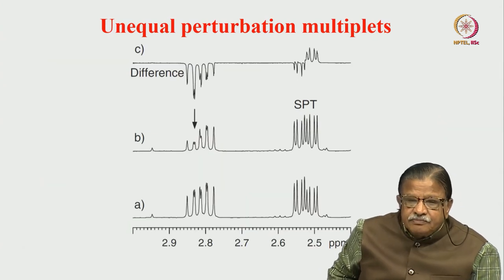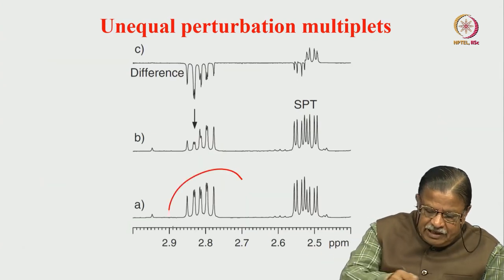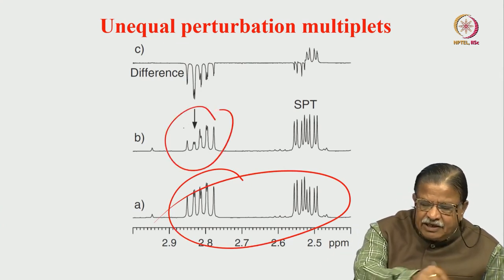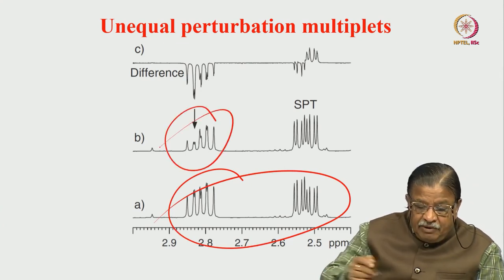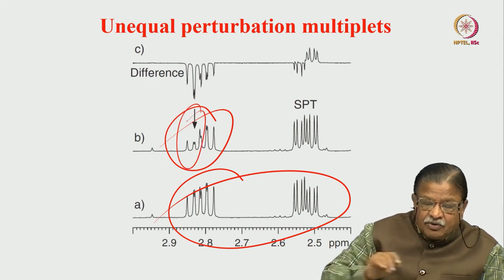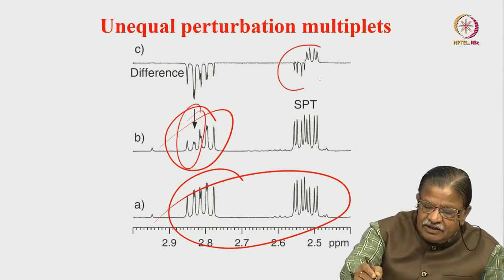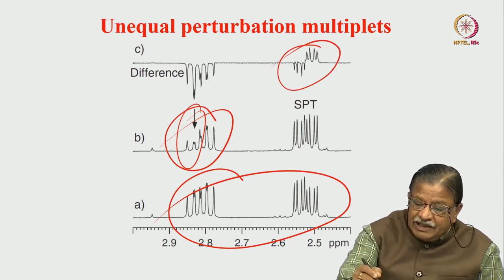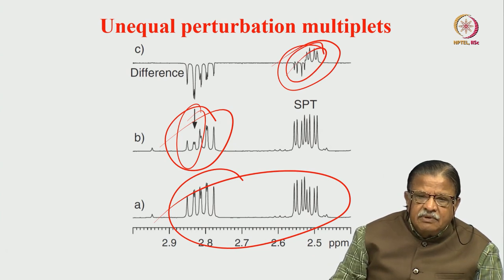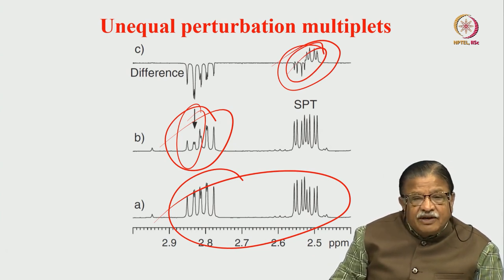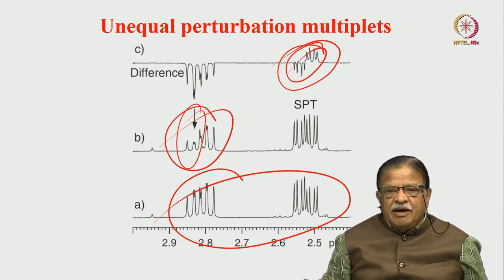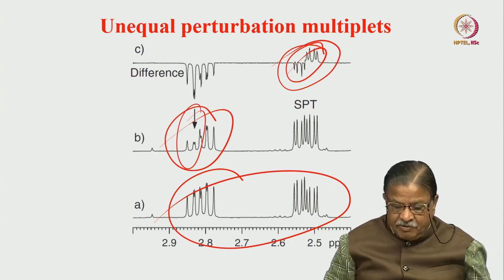This is an example showing what happens in a spectrum like this. This is selectively saturated, but you see it is not uniformly saturated. When the difference is taken, you can see there are anti-phase components. If you take the area of this, it may become zero — then you will not see any NOE even if there is one. These are all problems of unequal perturbation of multiplets. If the multiplets are not properly perturbed, you are going to get this type of problem.